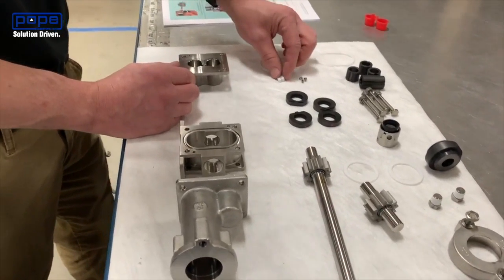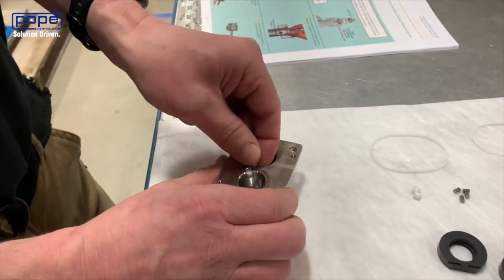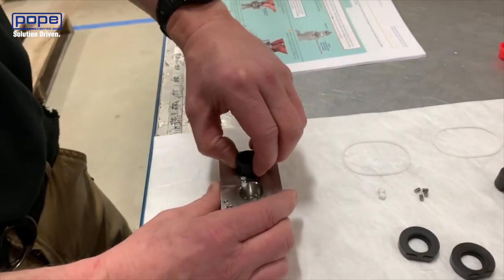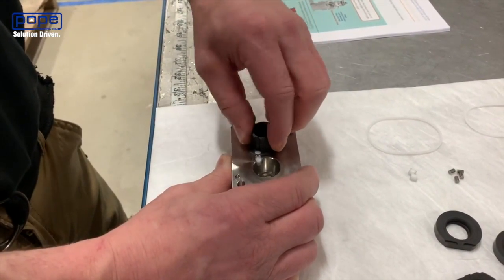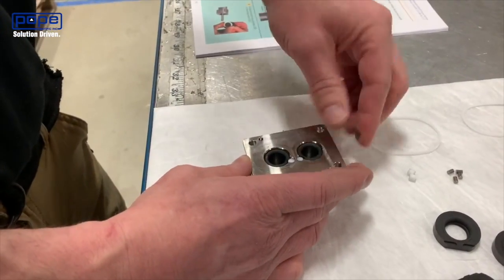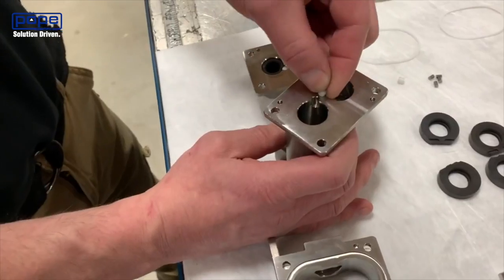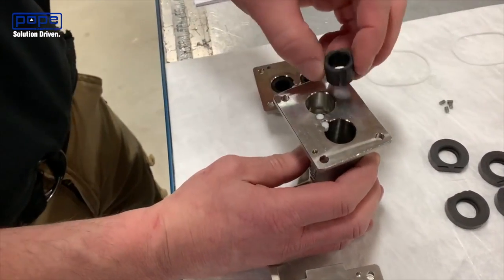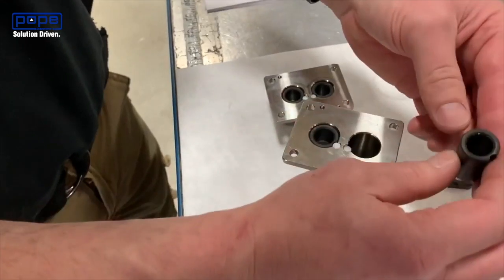Now we're going to be putting the pump back together. First, he's going to take the Teflon pins and install them into your rear housing, and install the bearings, one on each side. Now we're going to take the front housing, install the two Teflon pins, and install the bearings.